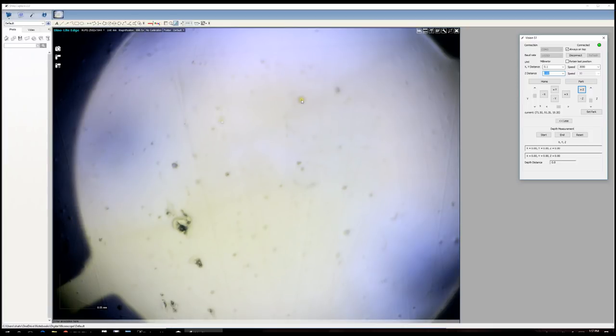Looking at the screen carefully, we're focused on the surface of the package of the RGB sensor. You can see some minor imperfections and blemishes on the plastic surface. Remember, this package is transparent because light needs to go through it — but it's not perfect, and on a microscopic level it has imperfections. I can change the Z distance and get finer focus depending on where I'm looking. Note that the whole module is not level, so you're going to see a gradient of focus — that's not the fault of the microscope, just because the platform isn't completely level. Now, what if I want to measure the depth of the package and see how thick it is? The Vision S1 software allows me to do that.